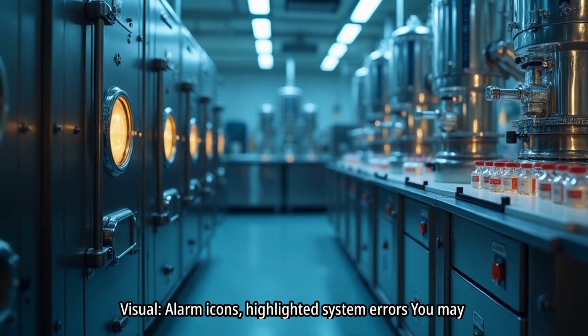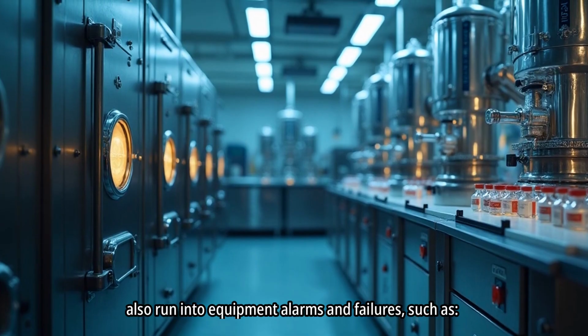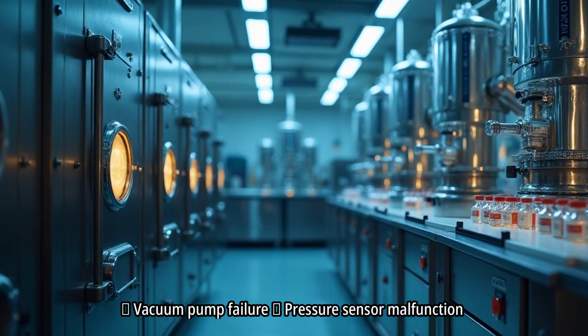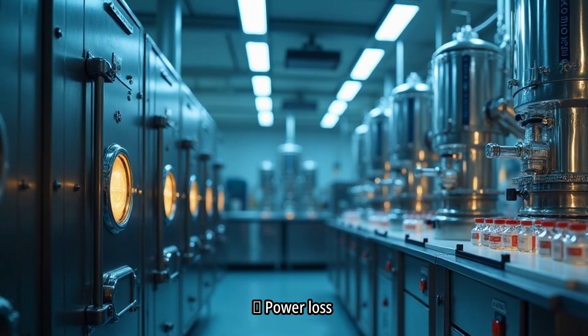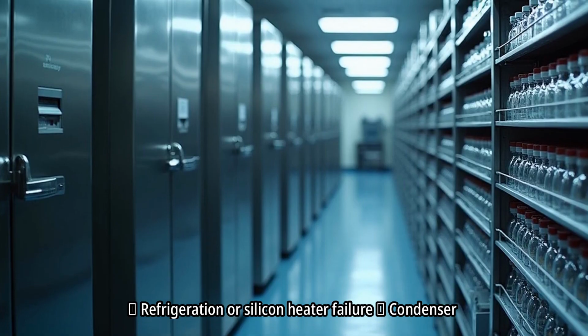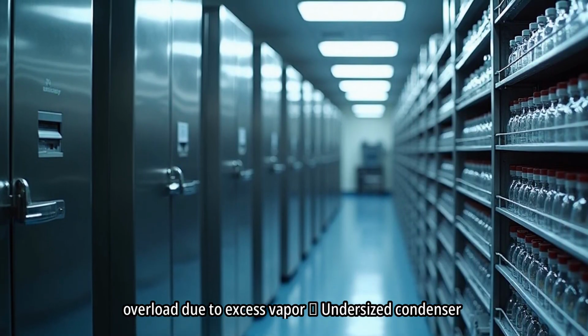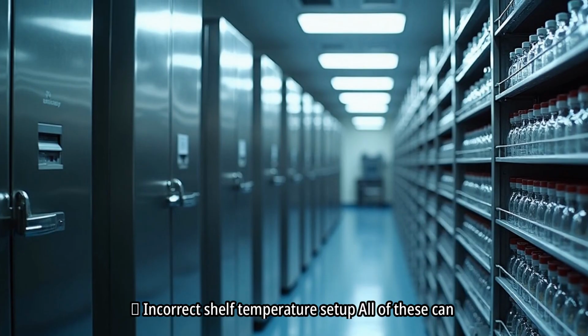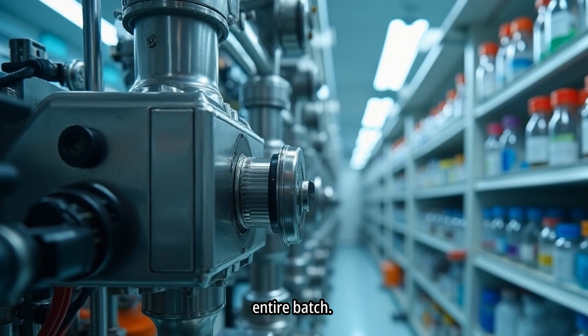You may also run into equipment alarms and failures, such as vacuum pump failure, pressure sensor malfunction, power loss, condenser refrigeration or silicone heater failure, condenser overload due to excess vapor, undersized condenser, and incorrect shelf temperature setup. All of these can jeopardize your entire batch.